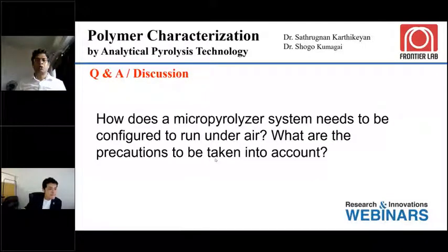Okay, I hope you got some answer from Dr. Shogo's presentation. And I think we have this carrier gas selector that will help you to really take care of this. Dr. Shogo, please add any further comments from your side in terms of the configuration.